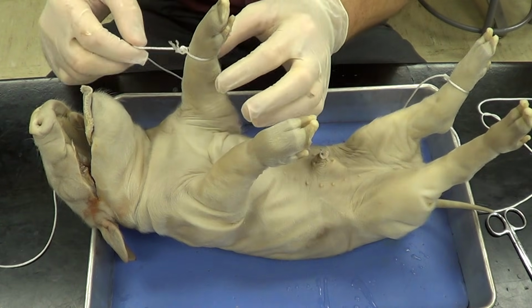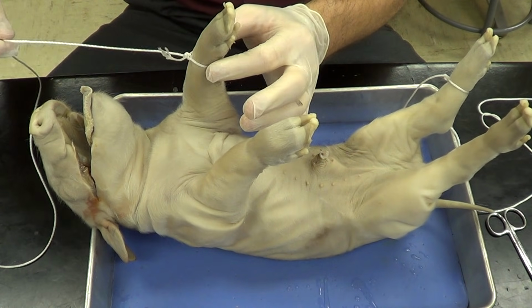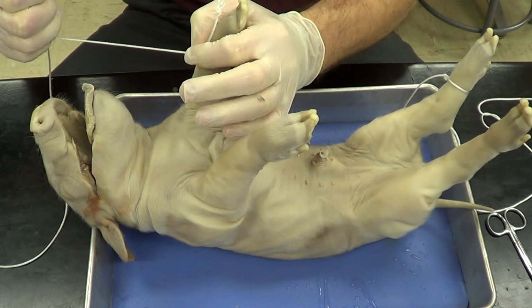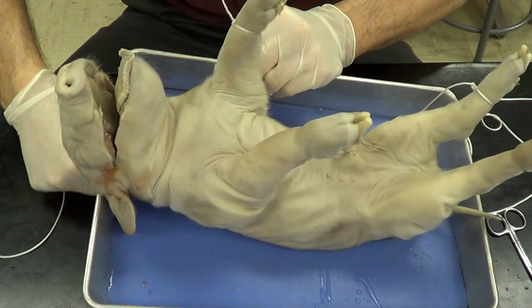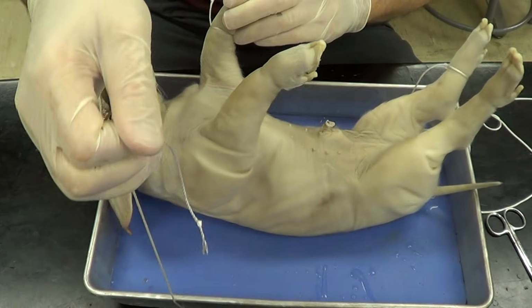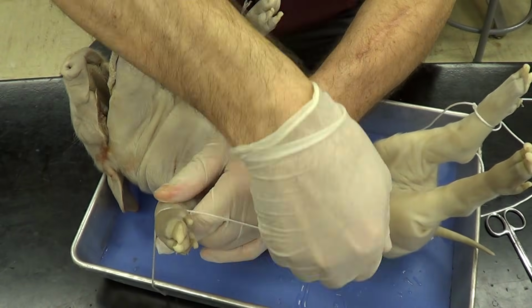So what I've done already is put a piece of string, a 1 meter length of string, around one limb. And I tied that off with just a simple knot. And then I'm going to take that string and bring it underneath the dissecting tray and pull that leg out of the way. And then I'm going to come around and do the other limb.